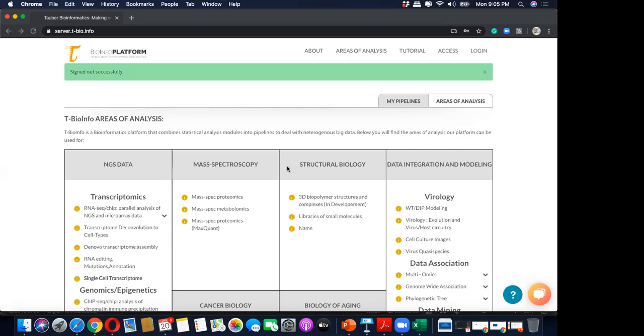Meanwhile, let me answer the question asked by Srijini. What is the difference between mapping and annotation? It's a very good question, thanks for asking. In mapping, the short reads that came through the sequencer are aligned to the exons. In our case, we are looking at the alignment where all those exons and introns are matched, and the reads are aligned at those specific positions where they match.